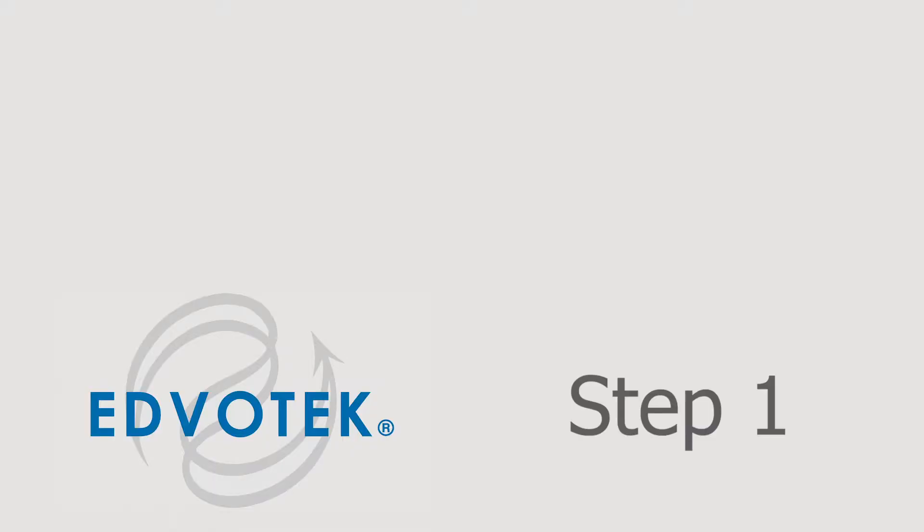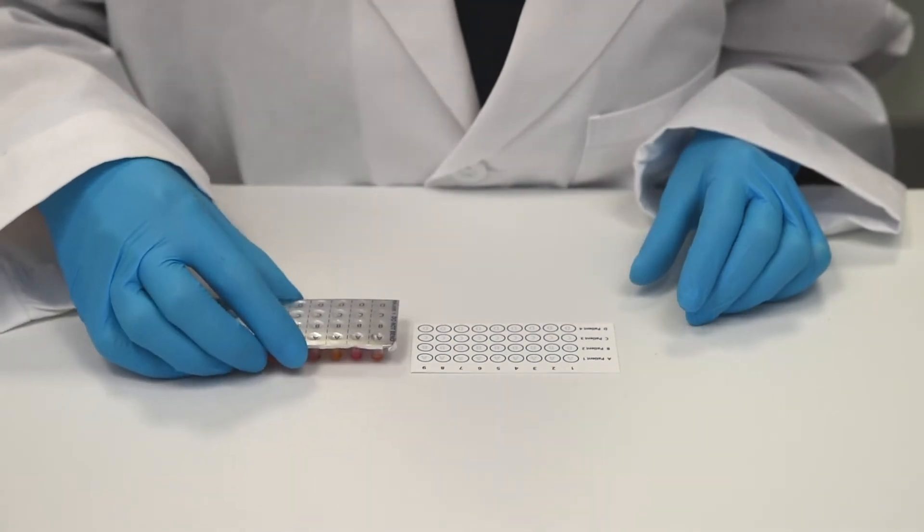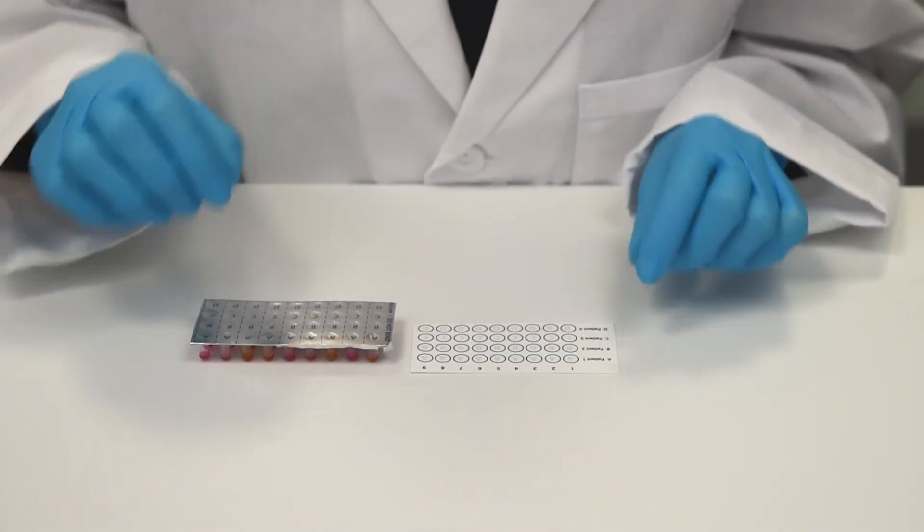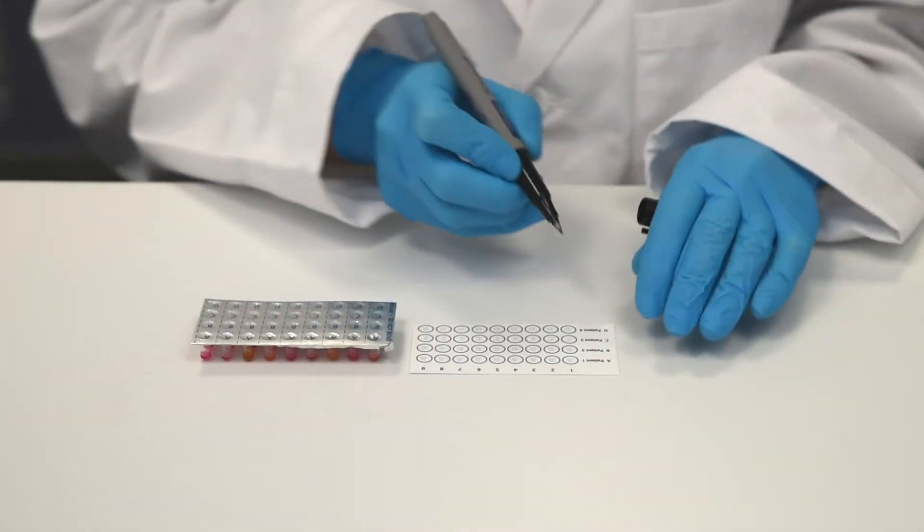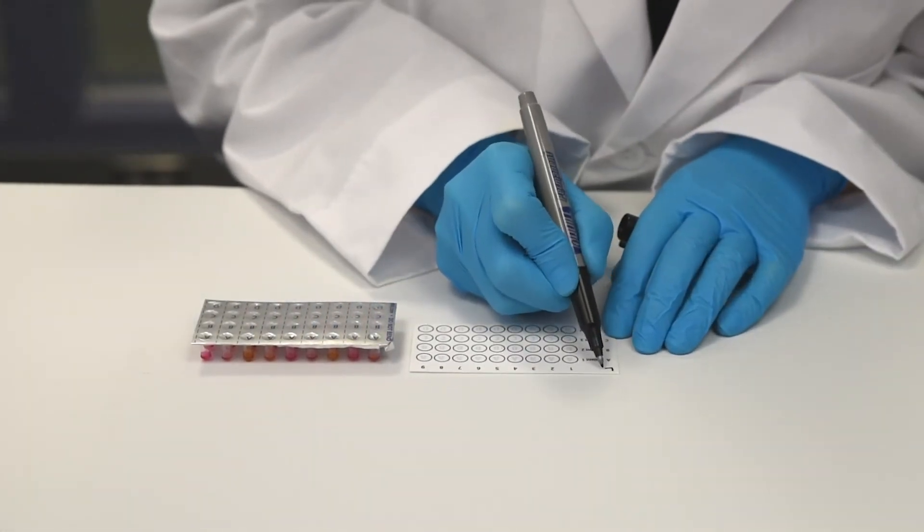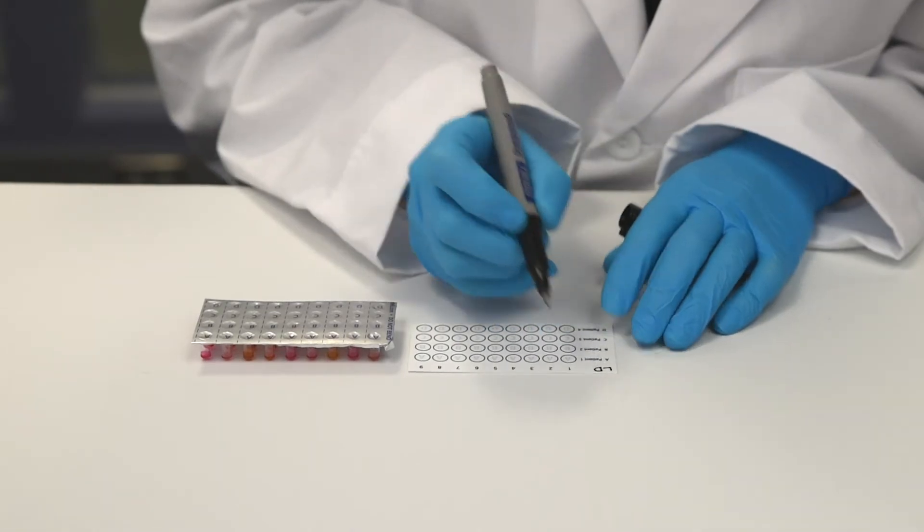Step 1. Orient the paper microarray card and quick strip plate so that patient 1 row A or row E is at the top left corner of each. Label the microarray card with your initials or group number.